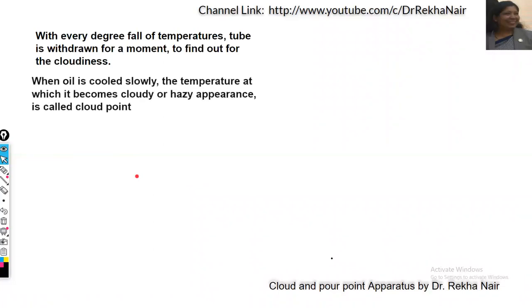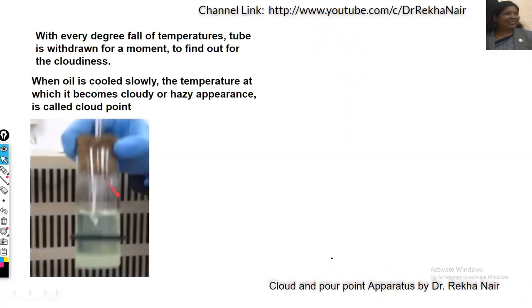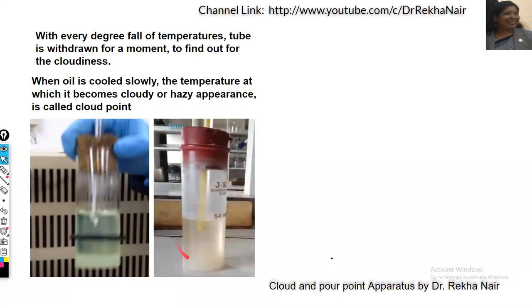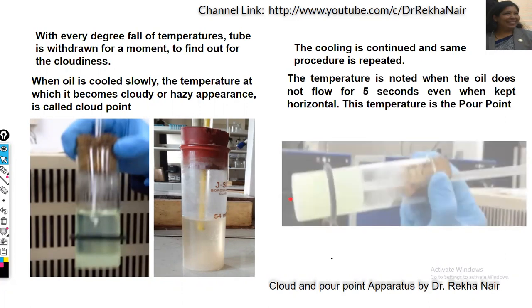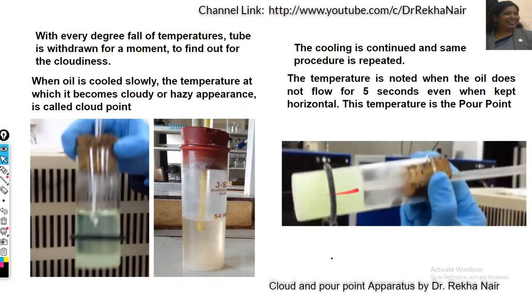With every degree fall of temperature, the tube is withdrawn for a moment to find out the cloudiness. When the oil is cooled slowly and shows a cloudy or hazy appearance, we call it the cloud point. Cooling is continued and the same procedure is repeated. The temperature is noted when the oil ceases to flow for 5 seconds even when kept horizontally — this temperature is called the pour point.